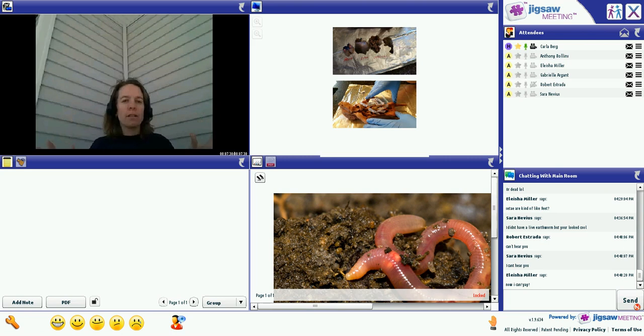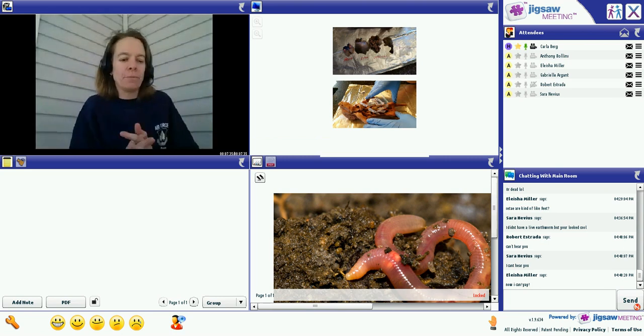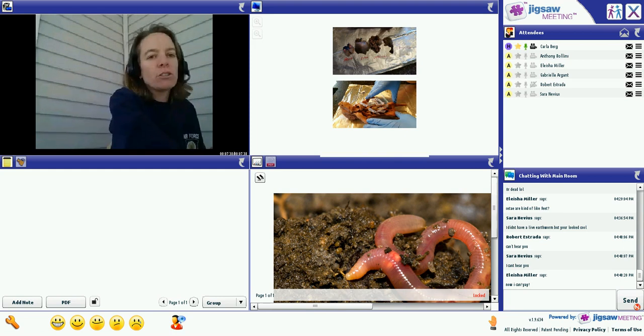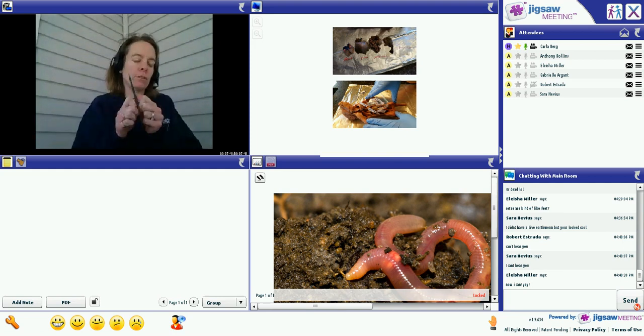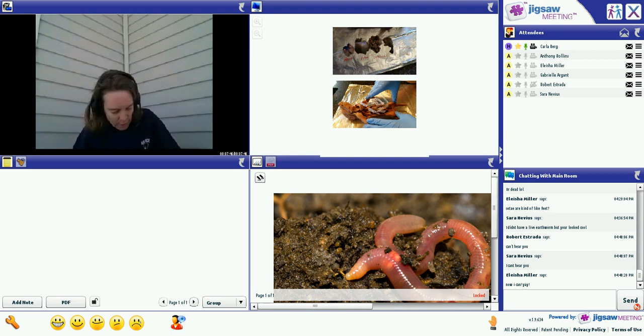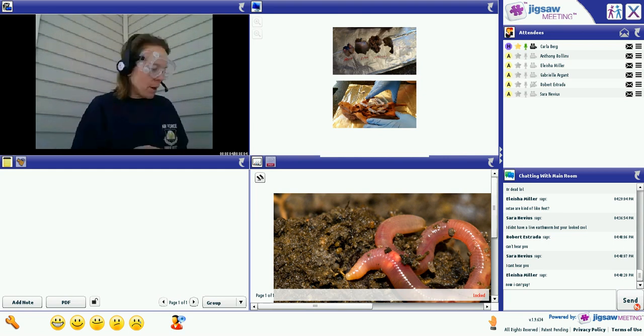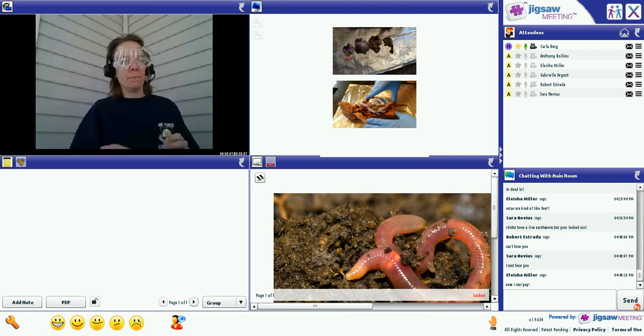Okay, now we are going to go a little slow just to make sure everyone stays together for this first dissection. The next tool you are going to use are your scissors. And I need to fix my safety glasses real quick because they came apart. All right. Anthony, once you are there, go ahead and click yes for us.